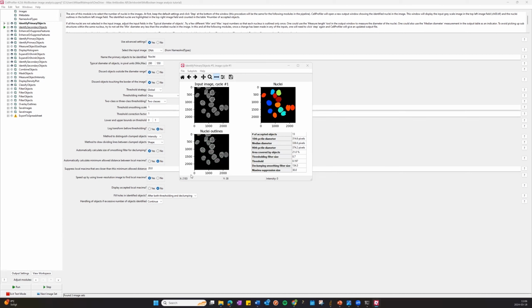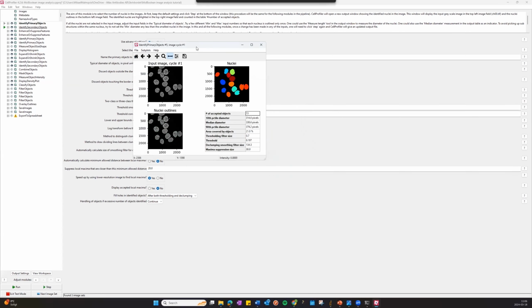Finally, I always want to mention that it might not be possible to efficiently determine the number of nuclei in the images. For example, it can be difficult in tissue images, where the nuclei are often less uniform or have varying intensities within the same nucleus. I will show you how to analyze those images in this tutorial at the end. But basically, then you will not really use this module where you select the nuclei. I'll get to that later.